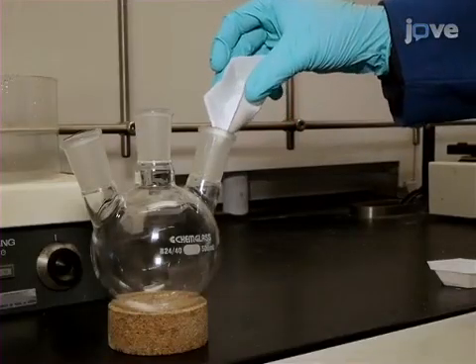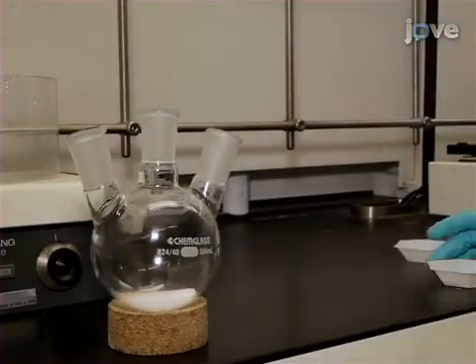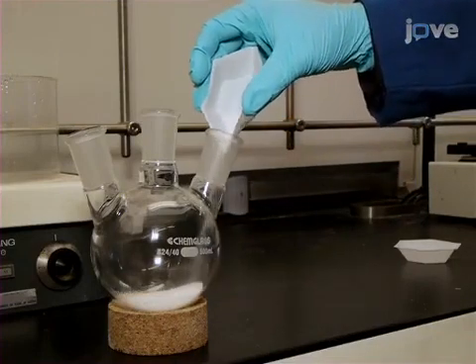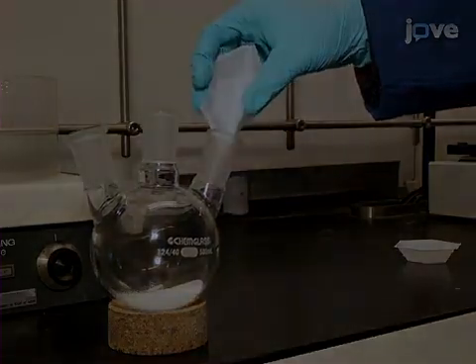Add 8.9 grams of D-alanine and 11.9 grams of potassium bromide to a 500 milliliter three-neck round-bottom flask with a magnetic stir bar.